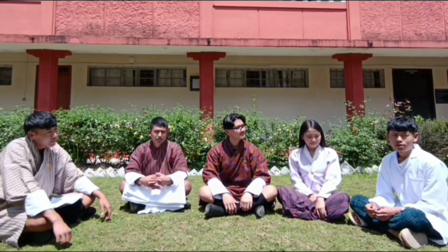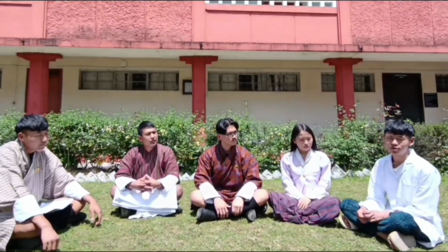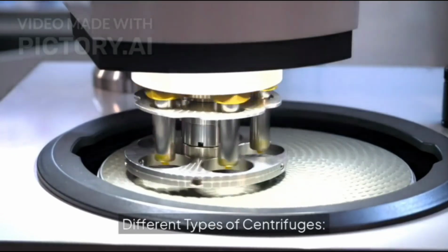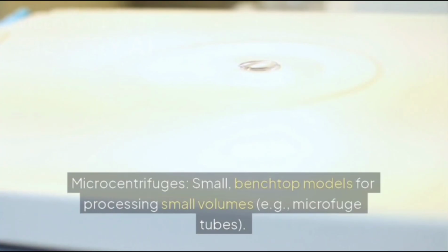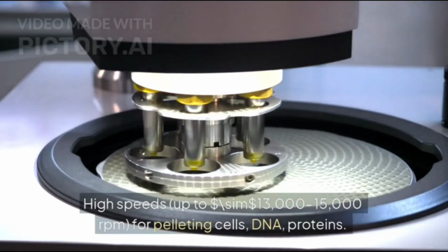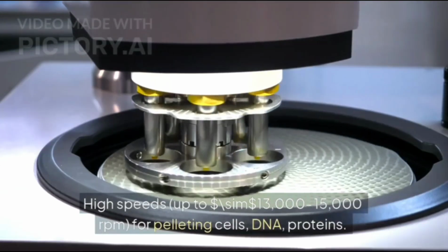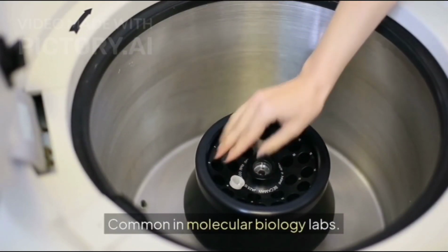So, each type of centrifuge is special due to a combination of factors tailored to specific needs in the lab. Different types of centrifuges. Microcentrifuges: small benchtop models for processing small volumes, for example microfuge tubes. High speeds up to 13,000 to 15,000 RPM for pelleting cells, DNA, proteins. Common in molecular biology labs.